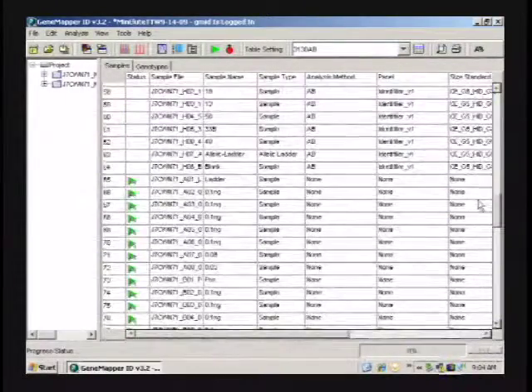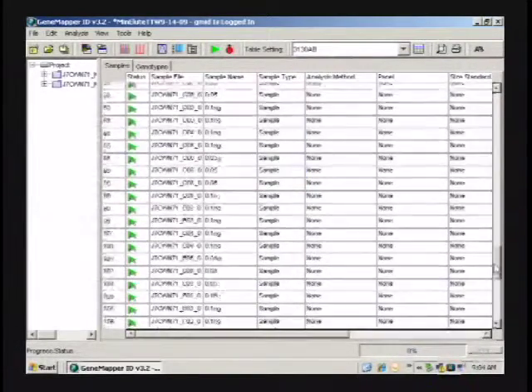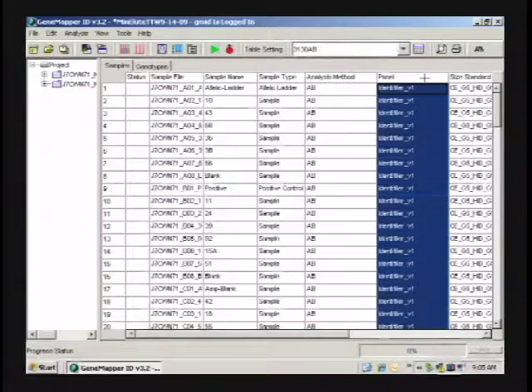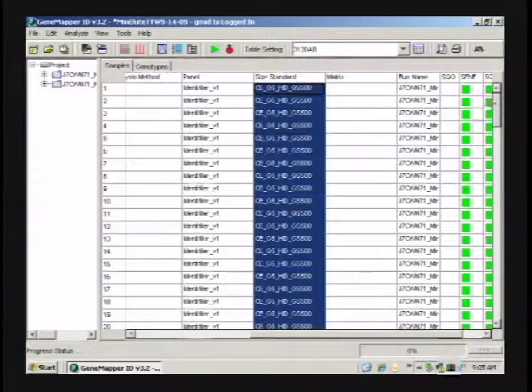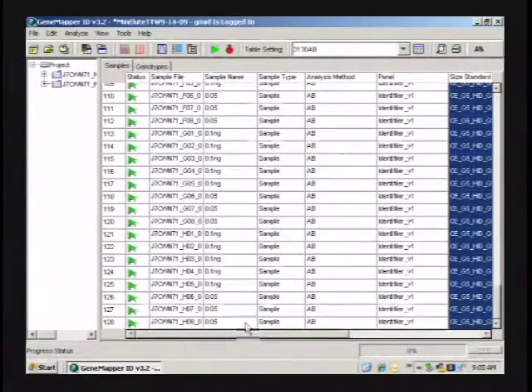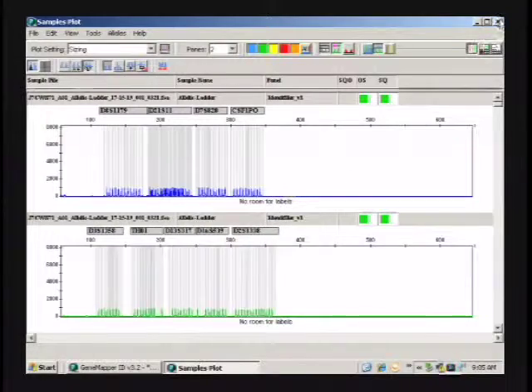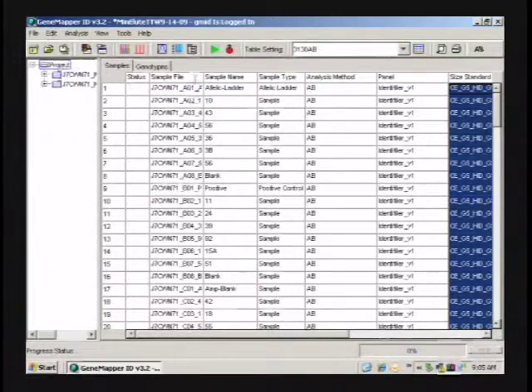This should be everything here. I don't know if this ladder will work for everybody, but we can try it out. Let's just do another ladder. Why is it saying that? You have to analyze again. Yeah, when I hit analyze... You hit plot window instead of analyze.